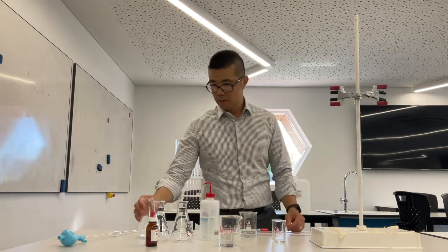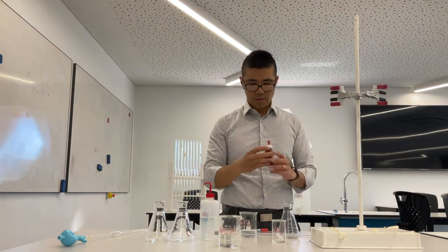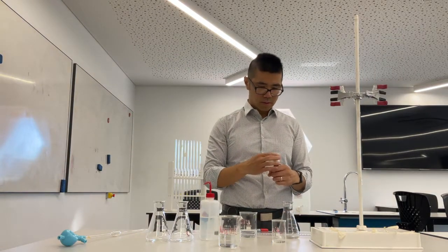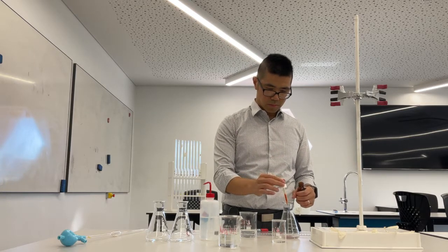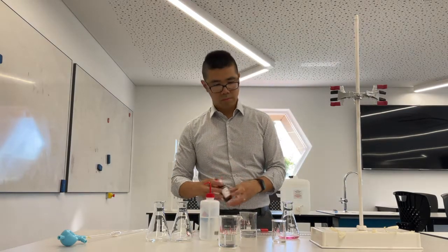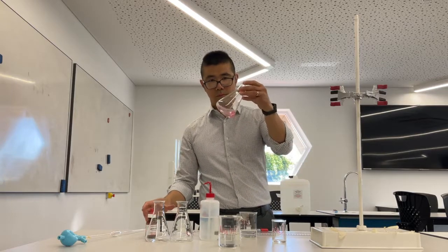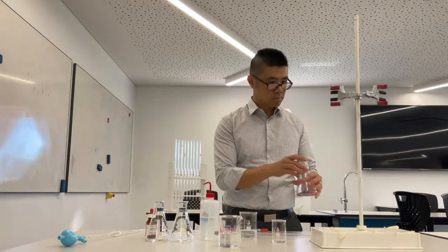I need to add some indicator, which has just appeared there. I'm adding indicator — you should add anywhere between three to five drops. Remember the indicator is a weak acid, so it will affect the concentration of the acid ever so slightly, so you should ideally use less. You'll see that it's a nice shade of pink. Now I've got to go clean the burette.